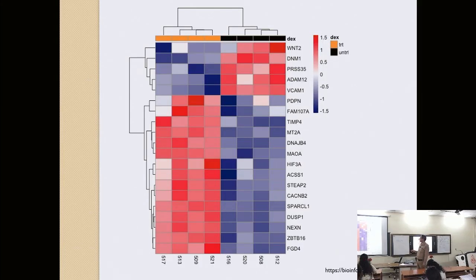Here is an example of agglomerative hierarchical clustering of genes. You can see through this method, the genes have got clustered based on the gene expression pattern, based on the abundance of the RNA transcripts. At the top, you can cluster genes, or you can cluster samples also, or both. At the top, you have the clustering of the samples.